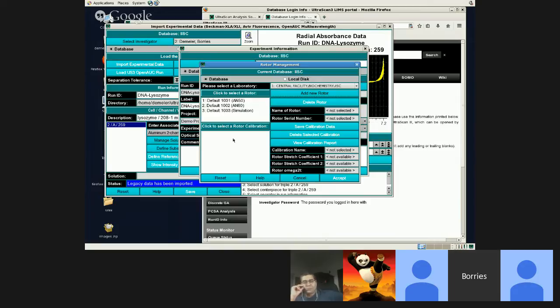You just load the calibration data into that program, and you define where the edges are, and then the program will extract those data out and calculate a statistical average over all of the speeds and all of the cells, or cell edges, that you've scanned.